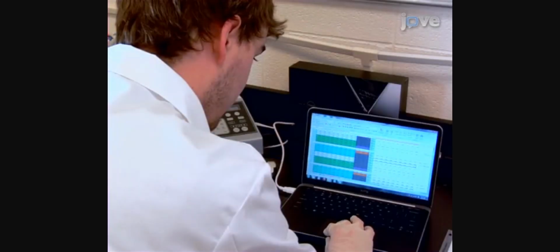For each time interval, calculate enzyme activity in nanomoles per hour per milliliter using the equation found in the text protocol. Examine the activity values calculated for each time step. Determine final potential activity from the time step with the highest activity. If activity values continue to increase, then later time steps may be required. If activity values fall throughout the course of the run, then run again with shorter time steps.